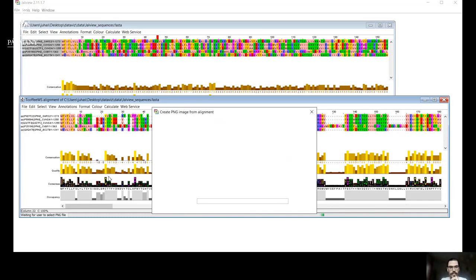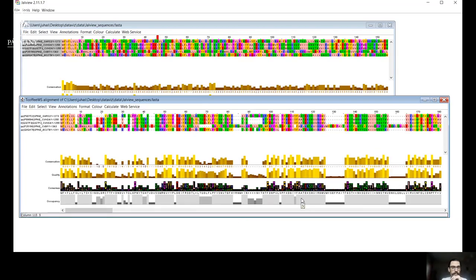And if it's ready, I can download it. Okay, I save that image.